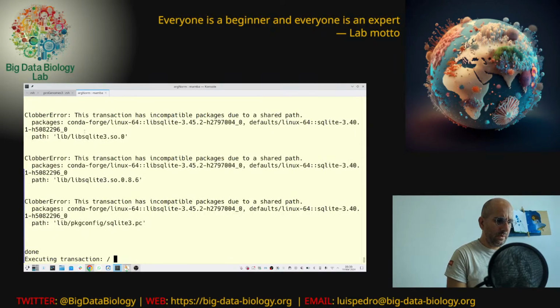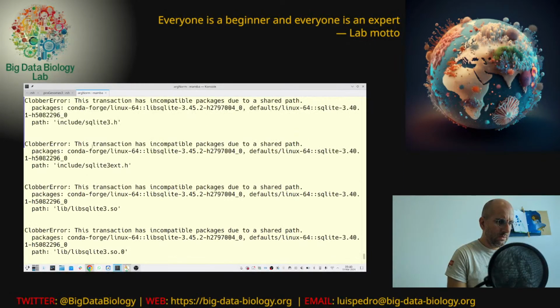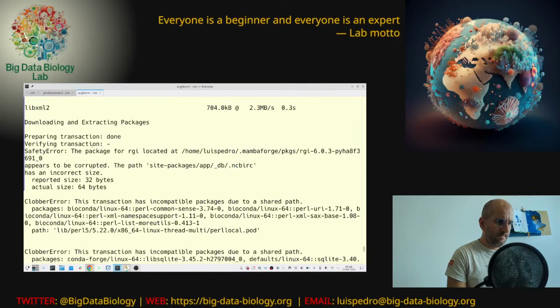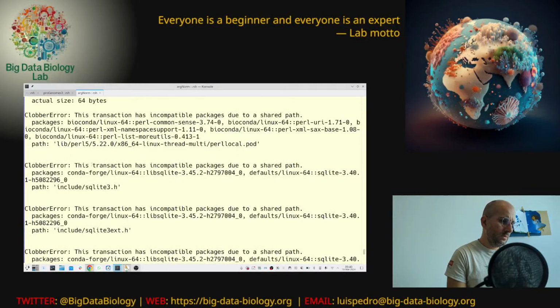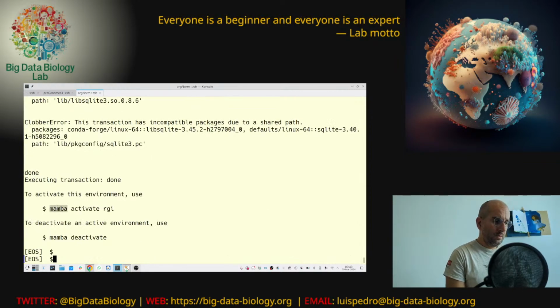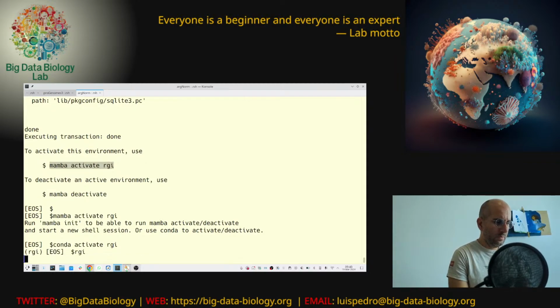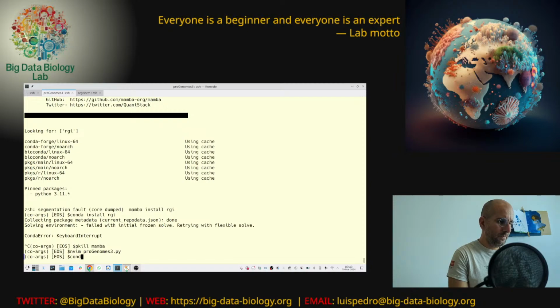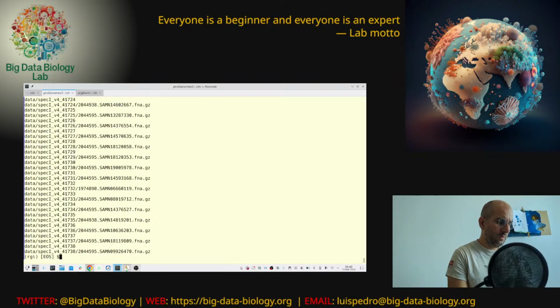Okay, so this is running. Okay, great. Okay, so I'm going to run RGI.